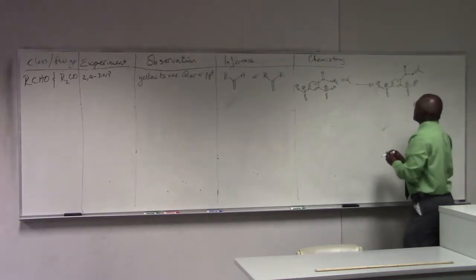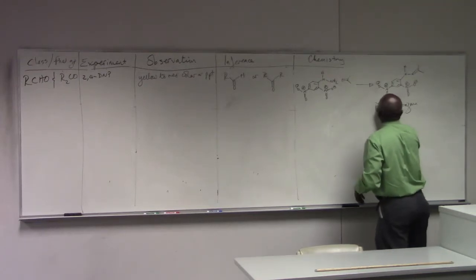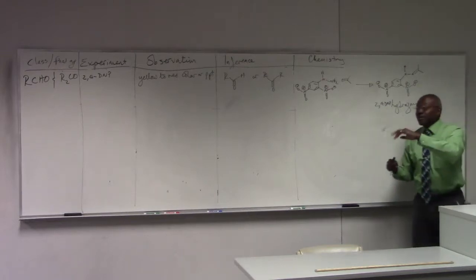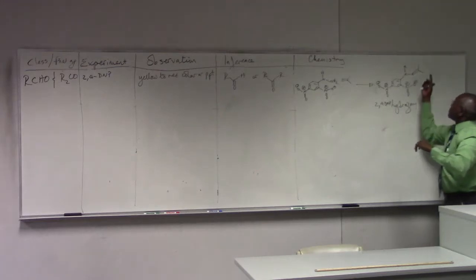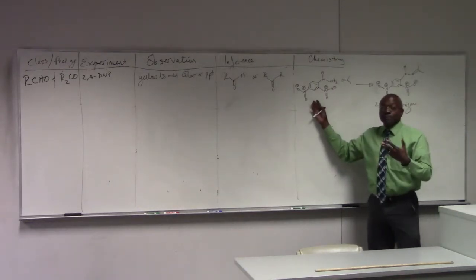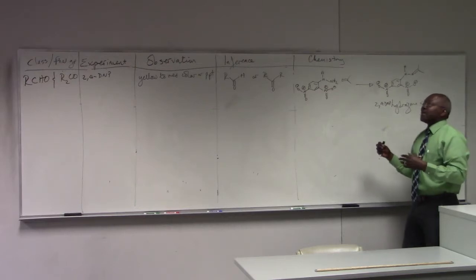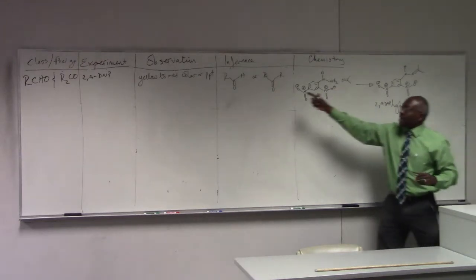And if you look at the 2,4-DNP hydrazone, the hydrazone is exceedingly conjugated. Now, by the way, this was conjugated to begin with as well, but hydrazone has a lot of conjugation, and so the product is going to be colored. Now, 2,4-DNP also has a color to it. But if you get a yellow to red substance, that screams that you had a carbonyl compound.